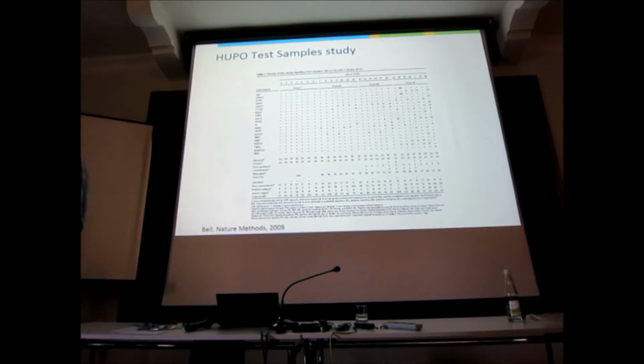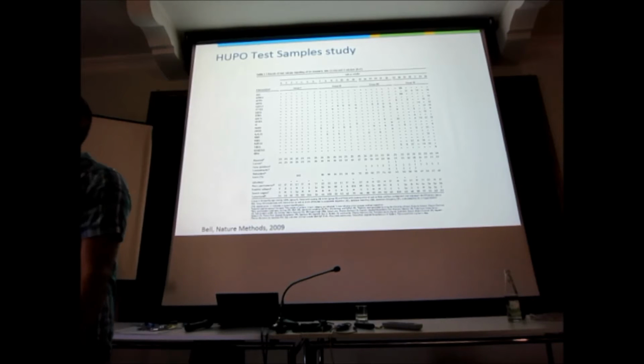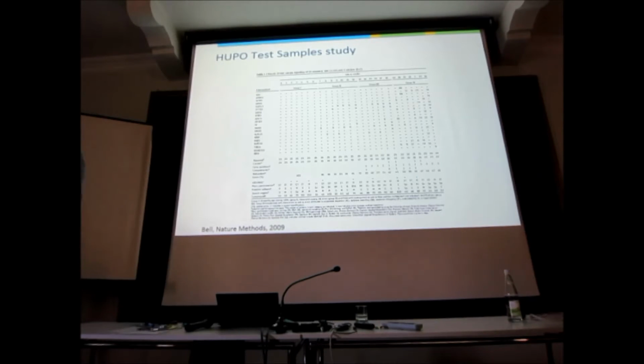And the problem here is this is the NCBI non-redundant database, which is enormously redundant. It contains all known splice variants, it contains all ever detected immunoglobulins, it contains all X-ray diffraction constructs, which are completely artificial. It takes all truncated forms ever recorded of every protein. So it's very easy to match a peptide to the wrong accession number. And they scored on the accession number. So they're not testing mass spectrometry, they're testing protein inference, which we frankly suck at. Okay? So this table gives you completely the wrong picture.